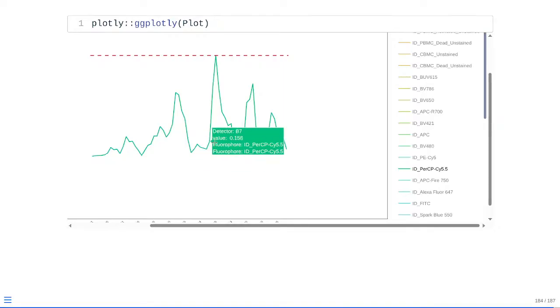So as you can see at this point now, we have assembled entire signature matrices for both our beads and our cell controls. We can then compare them to each other, and then also during week 14, we can use these signature matrices or the combination of above to actually use the best fits when it comes to actually unmixing our full stain samples.